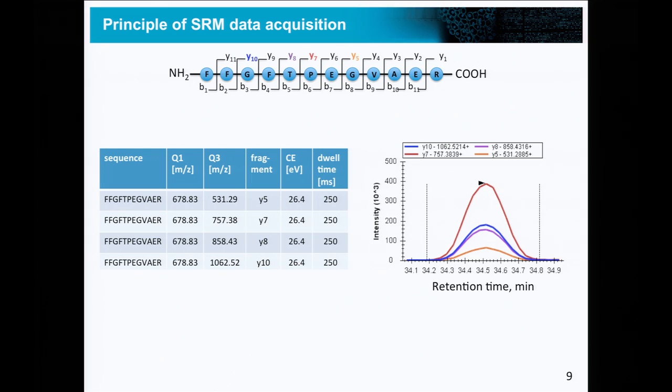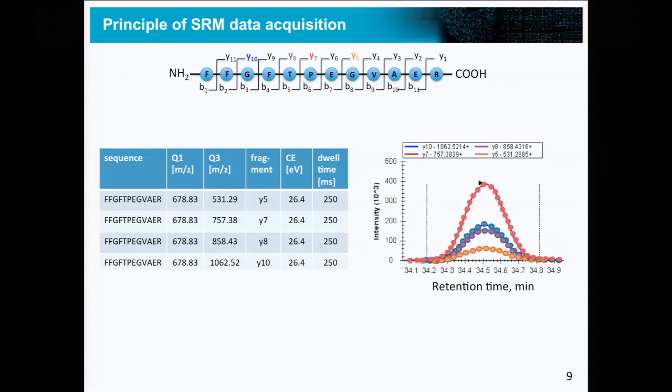However, in reality, these very smooth lines that you see here are not what is recorded by the instrument. These are already extrapolated lines by the analysis software. What the instrument really records, as I just told you, are distinct intensity values. So in reality, the data looks like this. It's only points over time, and the software then extrapolates these lines. And actually, there is one very important parameter, and that's the time difference between 2 of these neighboring points. This time difference is called the cycle time.